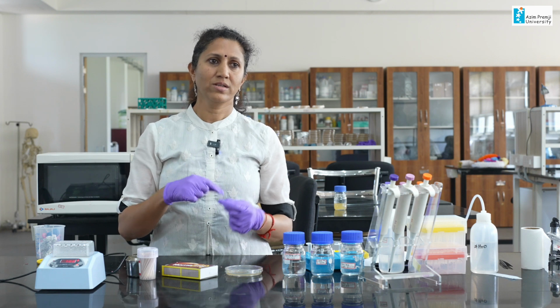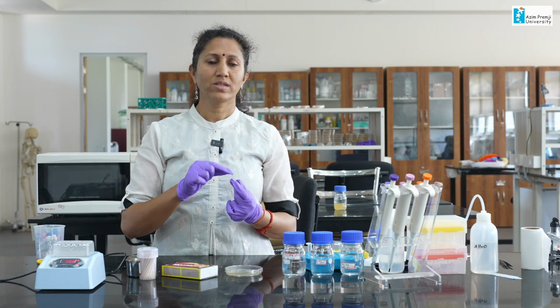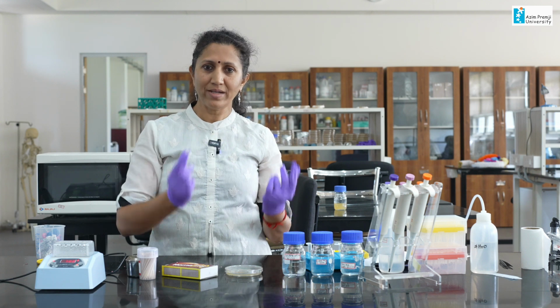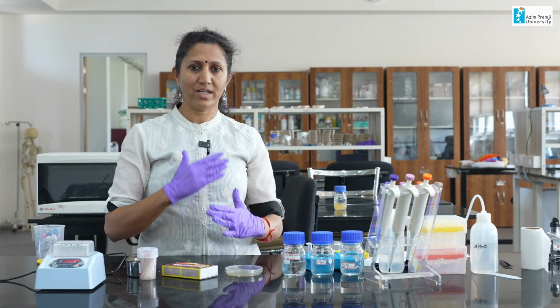The third step is precipitating the DNA, which is done by using chilled ethanol. Initially the DNA is dissolved in water. When you add ethanol, it separates the DNA from the water and the DNA gets precipitated. These are the basic steps involved in DNA isolation.